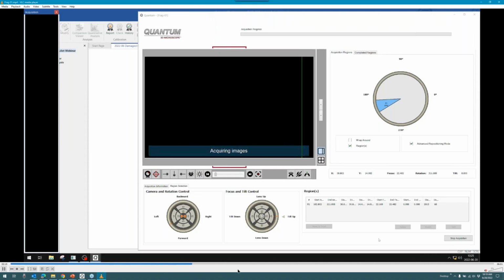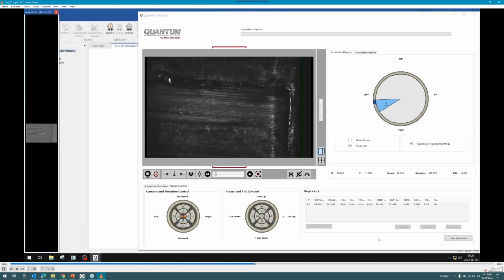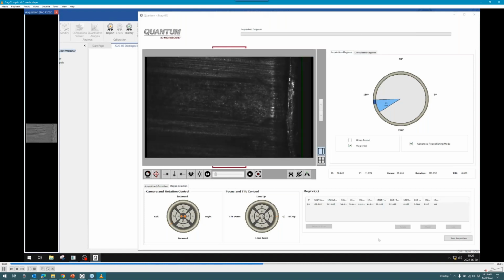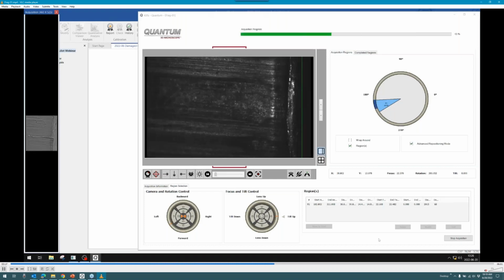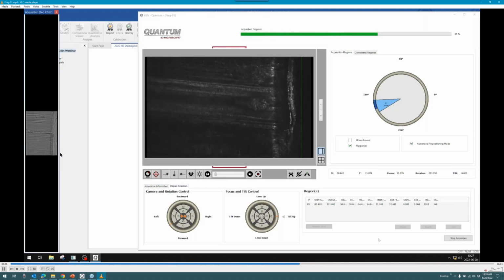And what we can do now is I'm going to jump forward slightly here just for the sake of speed. The acquisition's begun. This is something that's new here. If you saw the acquiring images blackness there, we no longer show a live view during the process where the light is flashing there. There's about 75, I believe, LEDs inside the system, each LED shining individually to illuminate the surface of the bullet as it's being recorded. And so once all of those images have been captured, they're compiled together, and then they're stitched together here to make the overall mosaic of the surface grow.